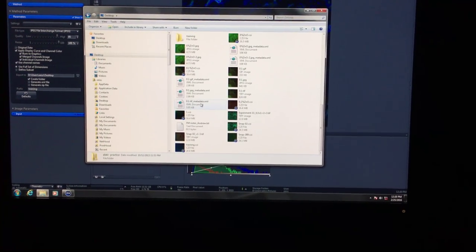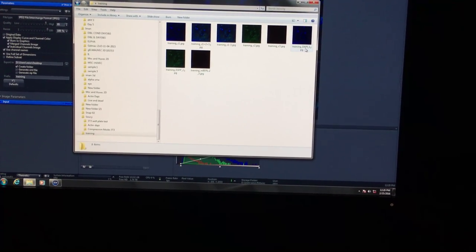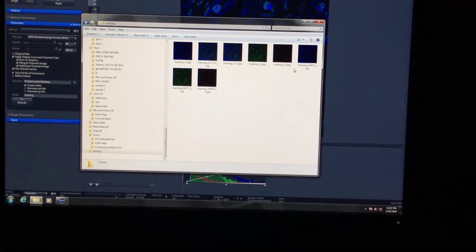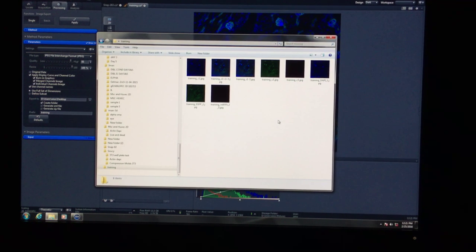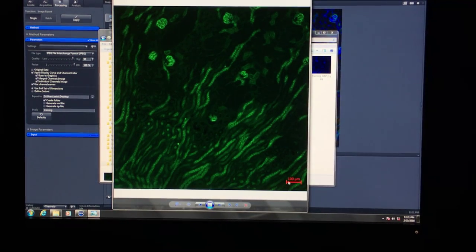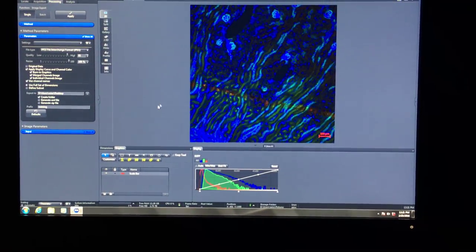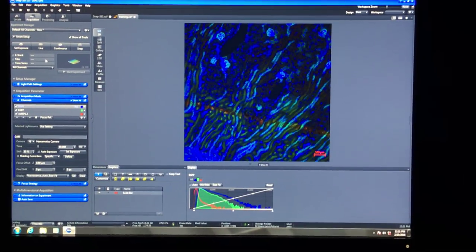Now you have training-DAPI, training-GFP, and the training merge. If you open any of the images, the scale bar should be there. Save these export settings—call it 'JPEG' for example—so you can reuse them later. There's a lot of important stuff in the processing tab.